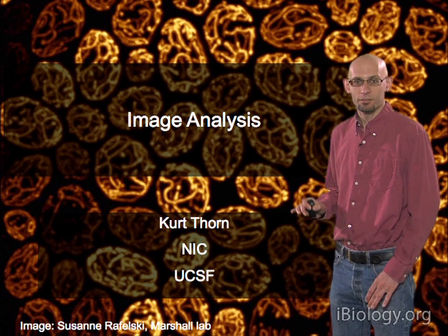And also, you would like to be able to do this threshold choice automatically, or at least in a sort of unbiased, objective way. And so this is just a screenshot from ImageJ from their thresholding. You'll see there's this auto button here. And if you use that auto button, it automatically picks a threshold. And this is the threshold it picks. You can see it does a pretty good job. It gets most of the dark objects, but not quite all of them.